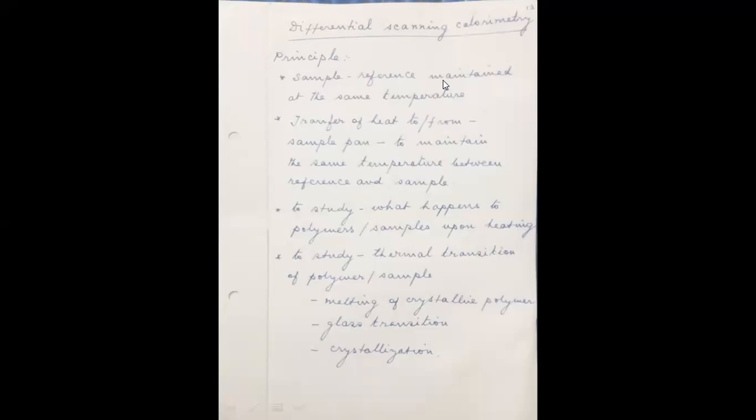The amorphous substances have varying linkages between the molecules. So the weakest will be broken first, a little stronger next, and then the strongest at the last. So you cannot mention any sharp melting point for amorphous substances because they melt over a range of temperature.